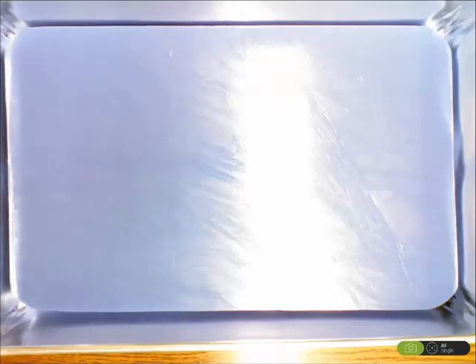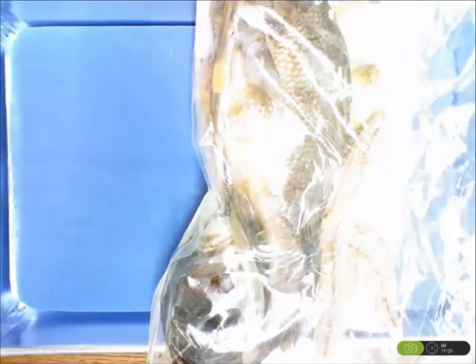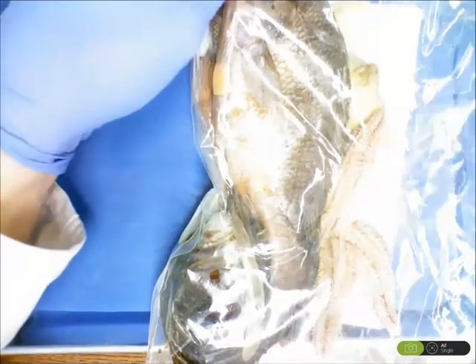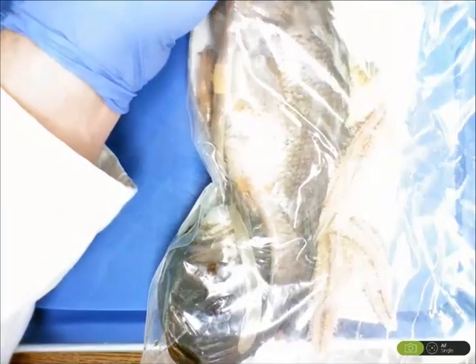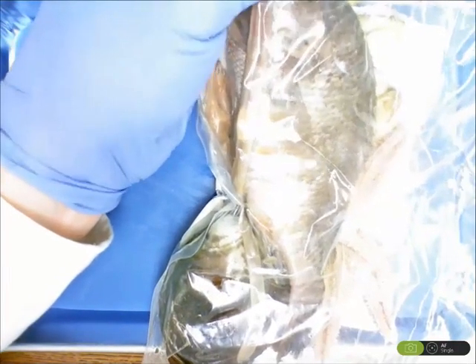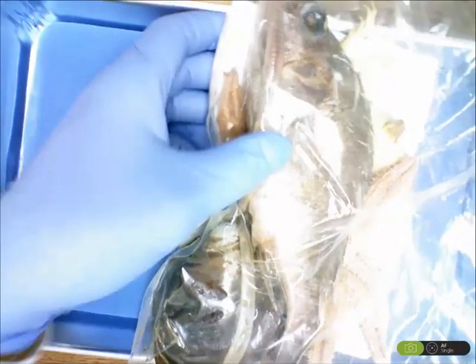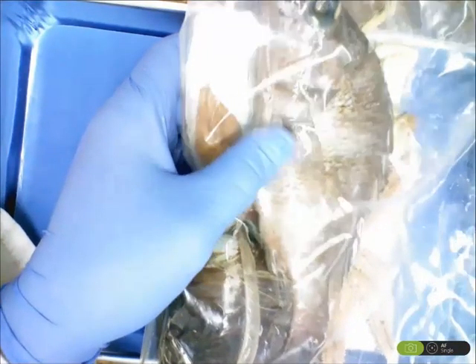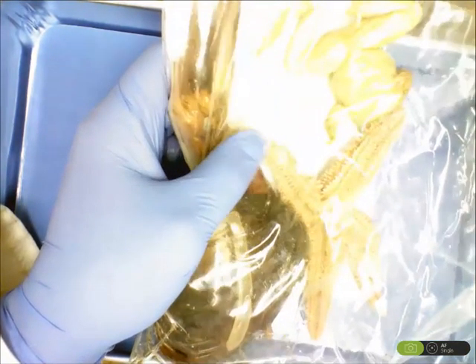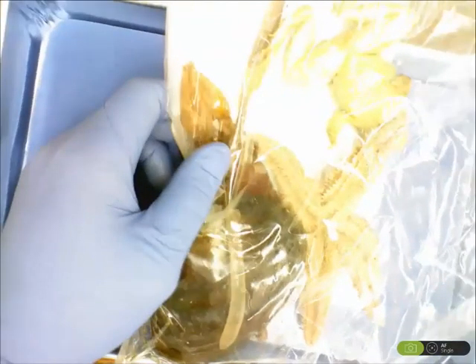For our fish dissection, you may end up with a specimen bag that has a large number of specimens in it. If that is the case, please make sure to open it up just far enough that you can take out the specimen that you are going to be dissecting. In this case, we want to take out just the fish. In our lab manual, it shows a yellow perch. We are actually going to be using a white perch. The anatomical structures are going to be exactly the same, but you will notice that the organism looks slightly different from the picture. So it may throw you for a loop there, but not to worry. All of the structures that make up that organism are exactly the same.